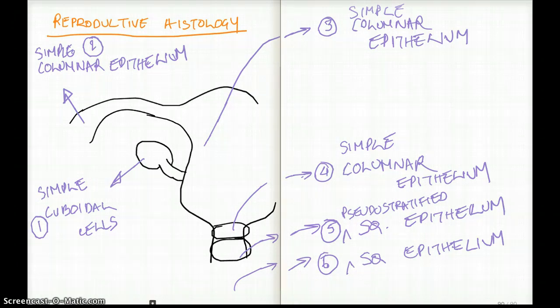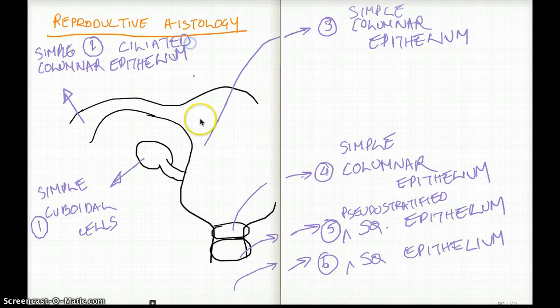Now, my next question is, are any of these cells ciliated? Yes, there is one section in this reproductive histology which is ciliated, and I'm sure you are screwing in your mind what that is. It's going to be our fallopian. So this is going to be simple ciliated columnar epithelium.